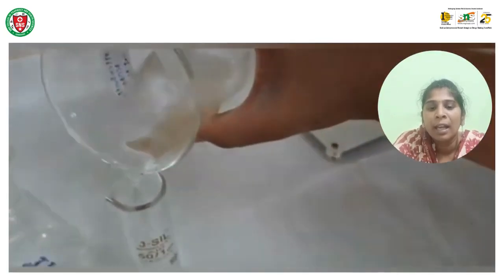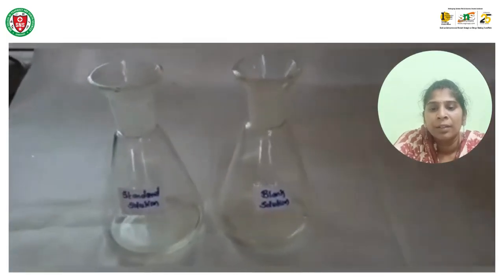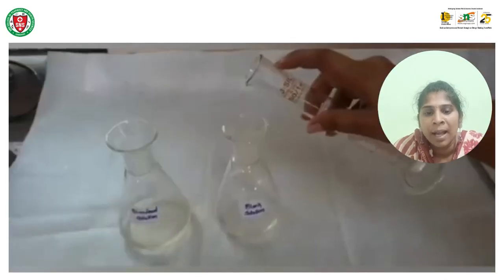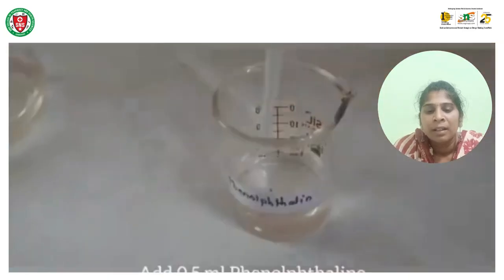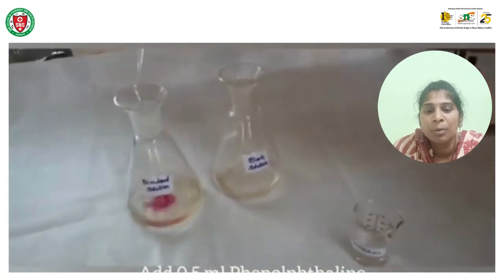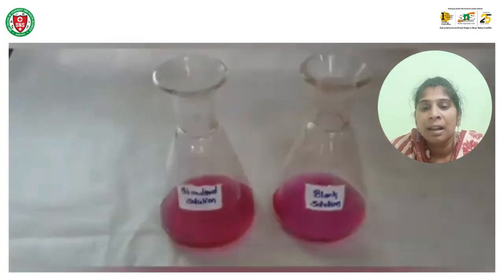25 ml of alcoholic potassium hydroxide in both the sample and the blank. We first added it in the standard solution, and now we are going to add it in the blank solution too. This we prepared as 60% alcohol, 40% water. Now we are going to add 0.5 ml of phenolphthalein as an indicator in both the standard solution and the blank solution. Now the standard solution and blank solution appear pink in color.